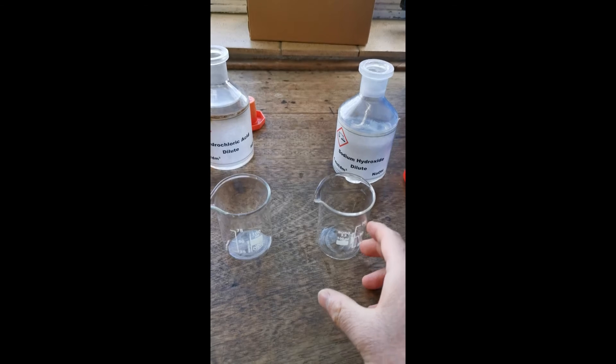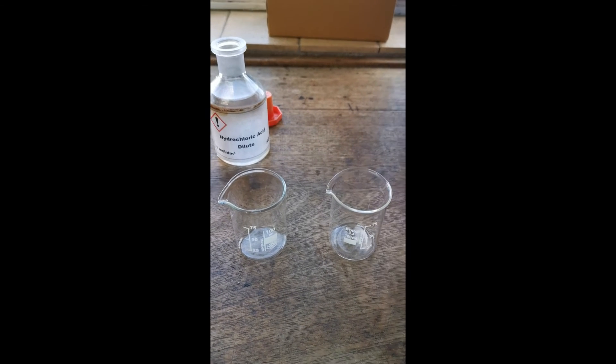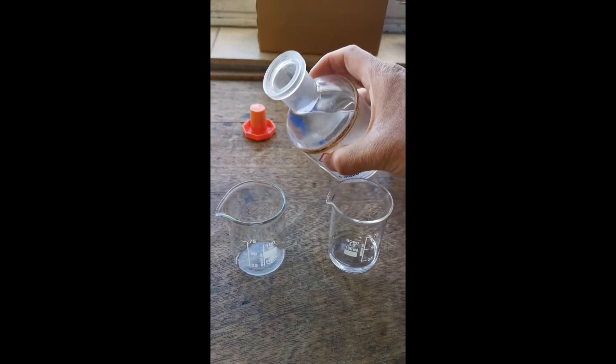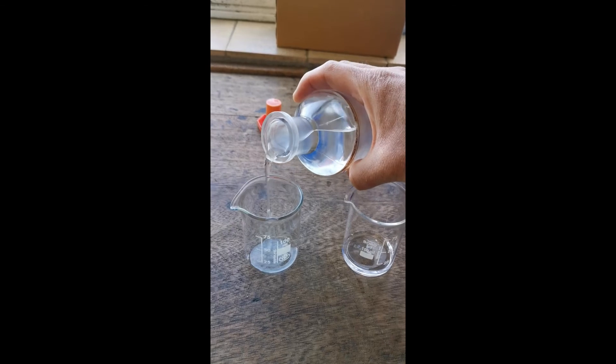Into this first beaker I'm going to pour in some sodium hydroxide, which is an alkali. And into the second beaker I'm going to pour in some hydrochloric acid, which is an acid.